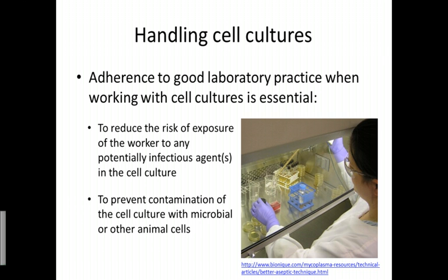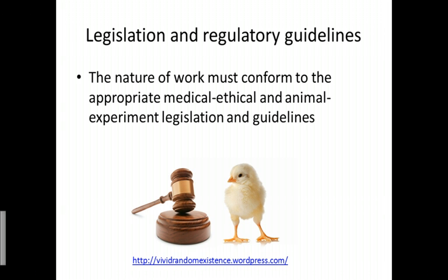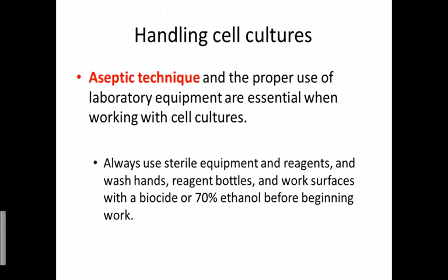This is to reduce the risk of exposing the worker to potentially infectious agents in the cell culture, as well as to prevent contamination of the cell cultures. So the nature of the work must conform to the regulatory guidelines and legislation. Aseptic technique and the proper use of laboratory equipment are very essential when working with cell cultures.